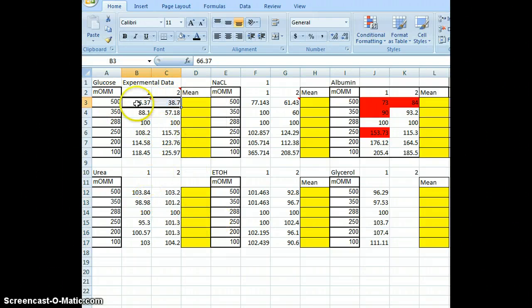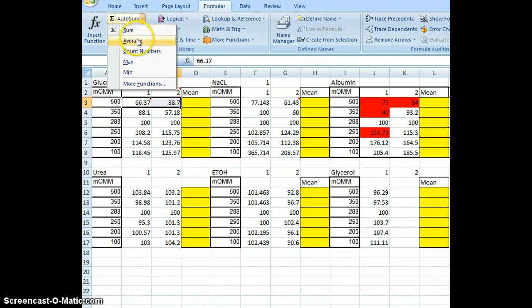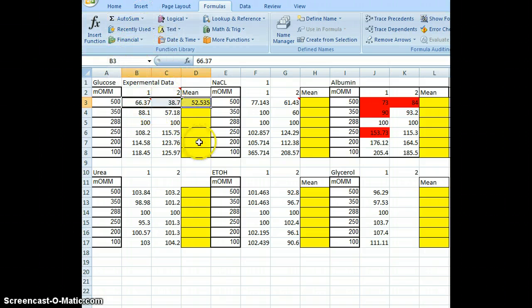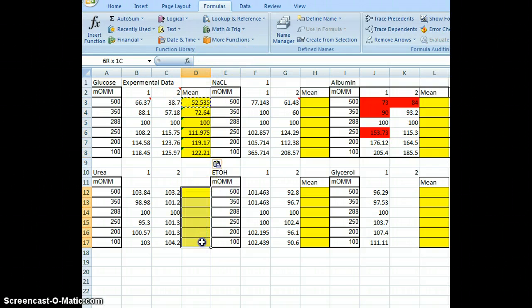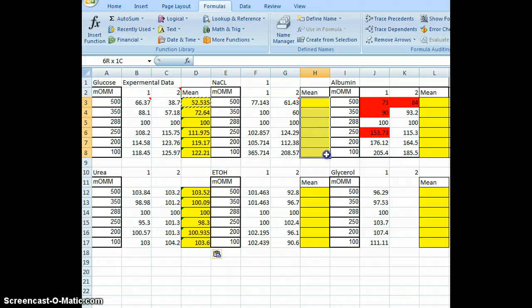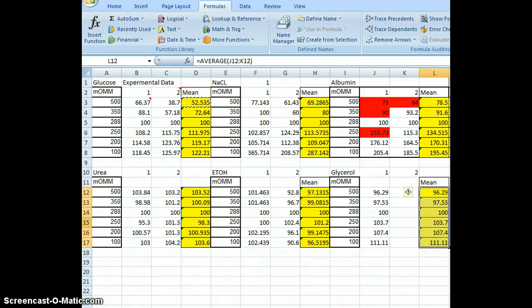I'm going to highlight these two values, go to Formulas, go to AutoSum, and average those two. I now need to do it in every single yellow square. So I'm going to highlight that one, Control+C to copy my function, and then wherever I see a yellow square I'm going to highlight it. Now I have my averages.